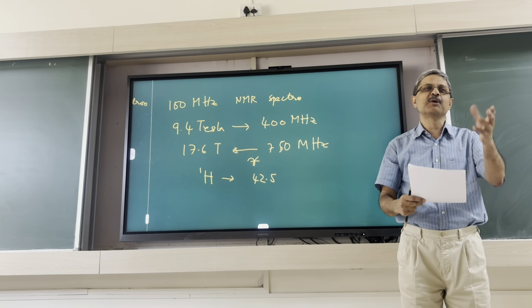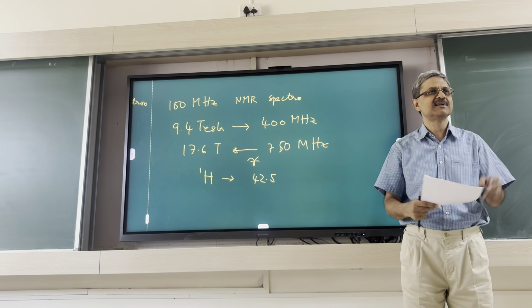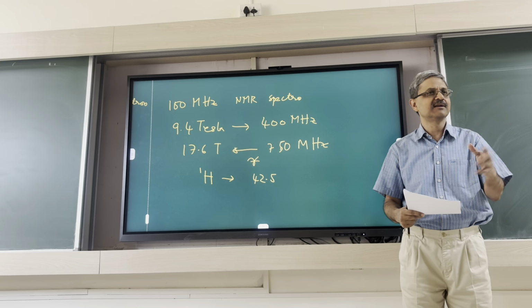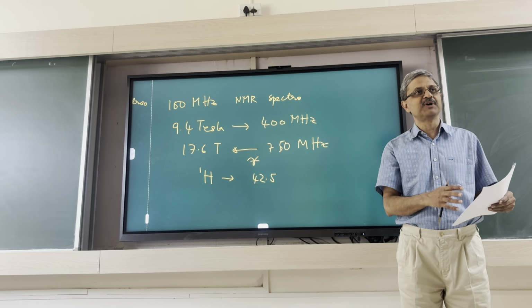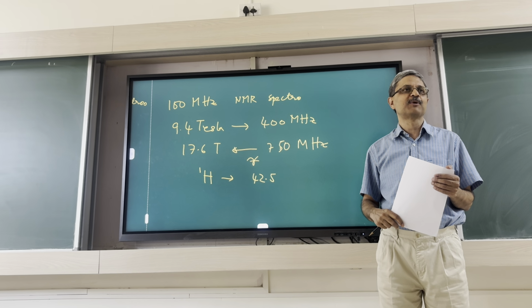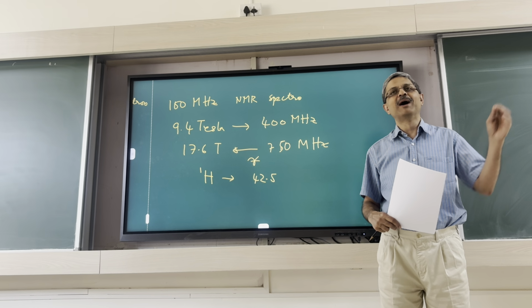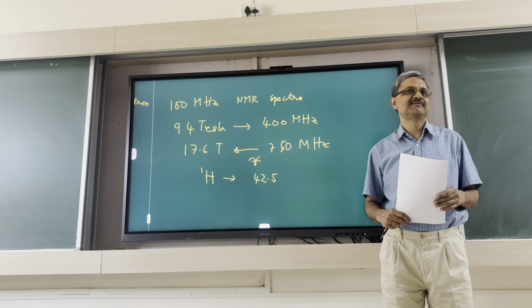Okay, but it is not fully pure at that time. It's not like 99.99 pure. Right? Some 95, 98, 99, that sort of purity. If you are recovering all the gas at this 98, 99% purity and returning to them, then the cost is about 15,000 rupees per 100 liters, which is very low. If you buy in open market, you pay more than 2 lakh for 100 liters.